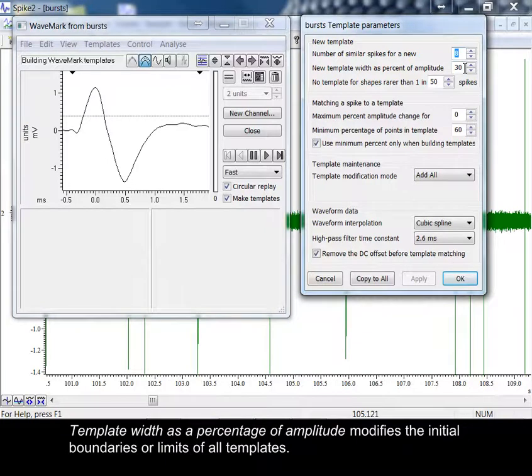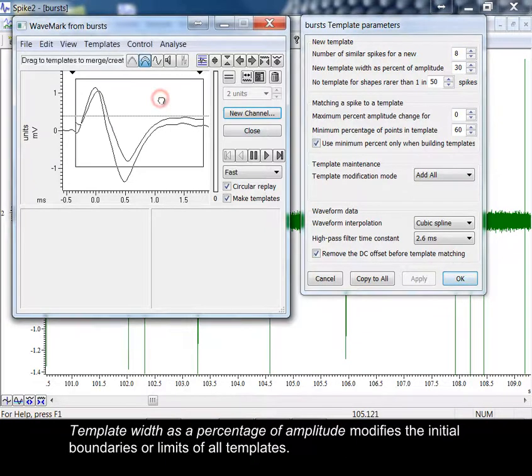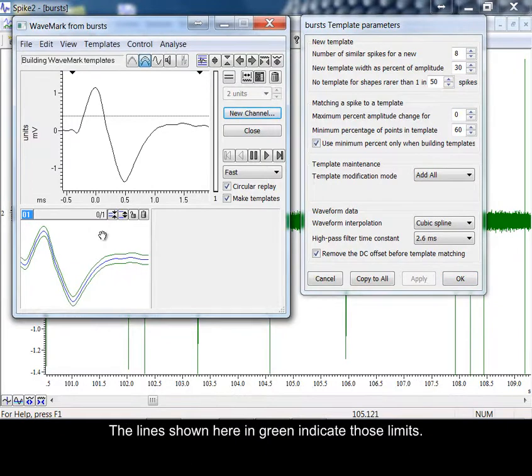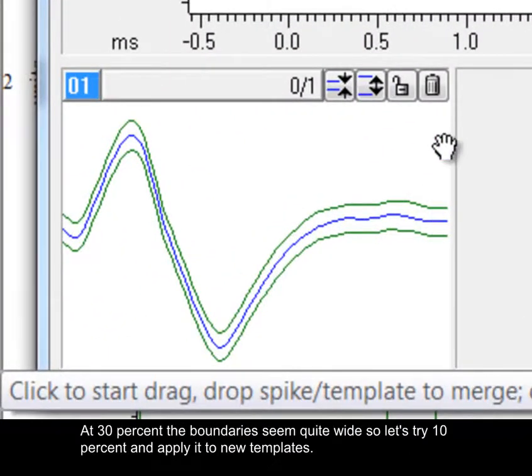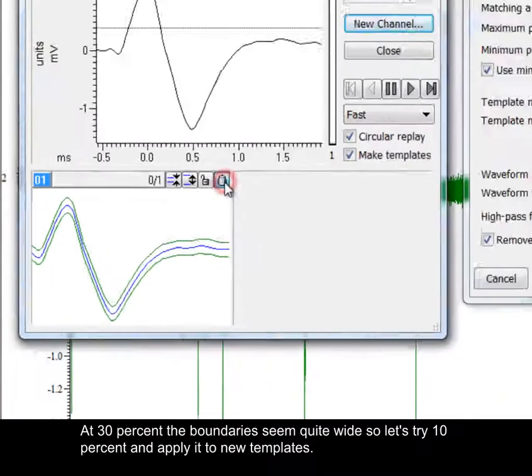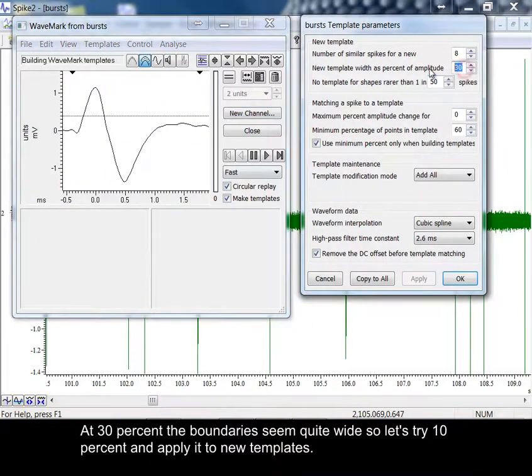Template width as a percentage of amplitude modifies the initial boundaries or limits of all templates. The lines shown here in green indicate those limits. At 30%, the boundaries seem quite wide, so let's try 10% and apply it to new templates.